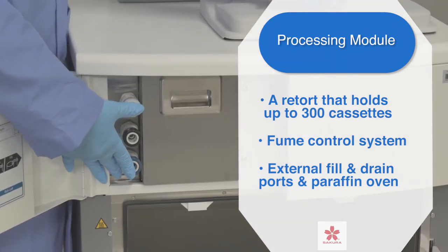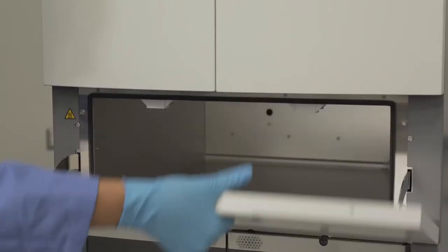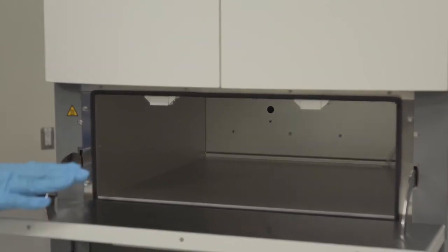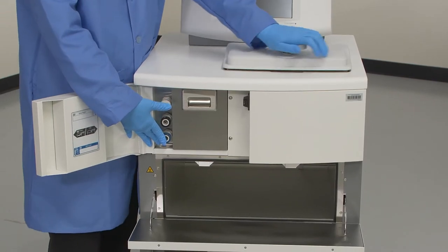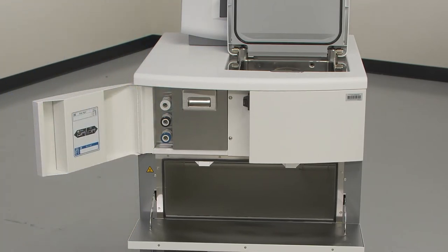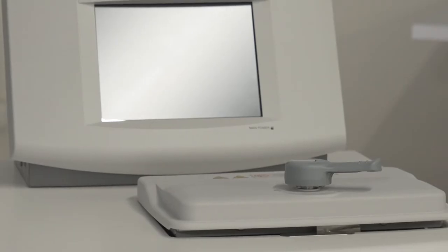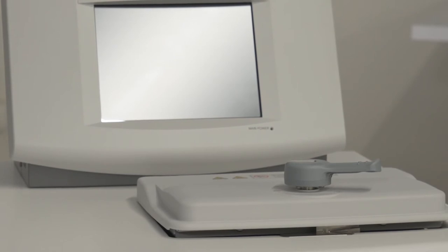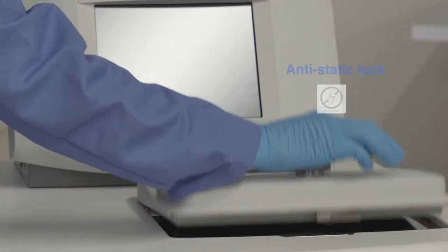Our VIP 6AI has the functionality to keep the cover on the retort lid heated at all times in order to reduce the formation of condensation, and it is the first model that has an integrated electronic retort lock. The handle is made of a special anti-static material to eliminate static electricity.